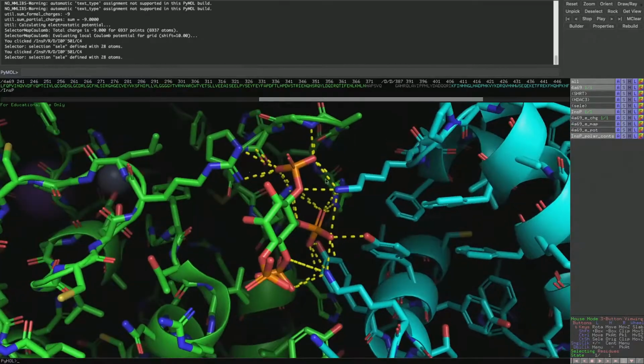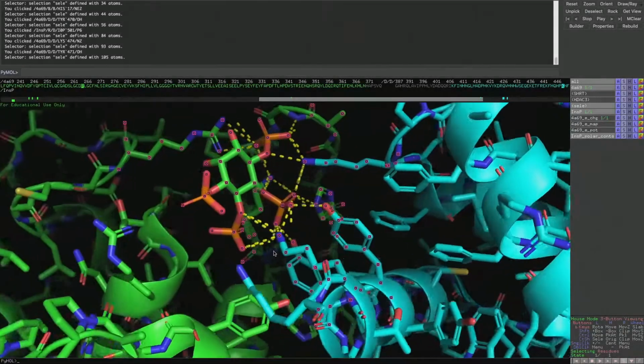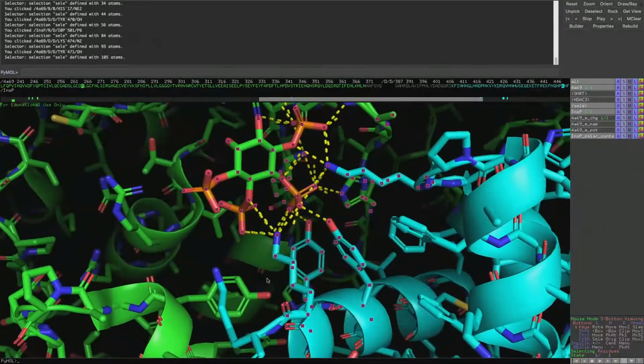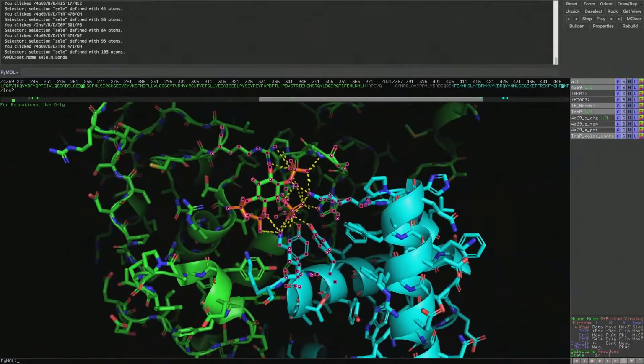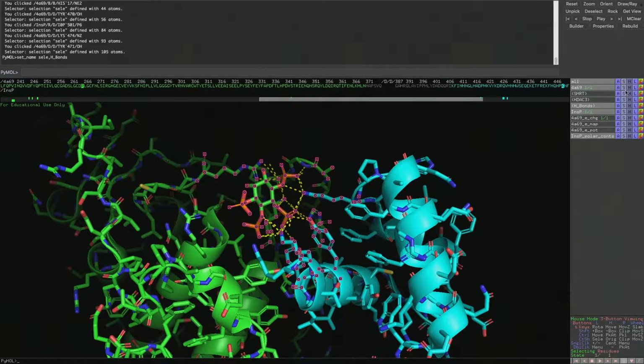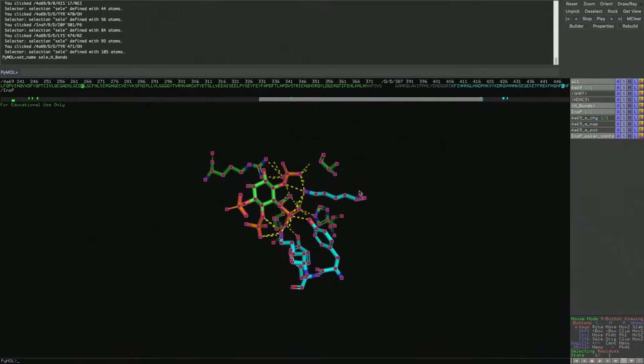So I'm going to select all of these residues, and I'm now going to make a new selection. So Action, Rename Selection. And these are the residues H bonds. And so I can now turn on and off that selection. So now in theory, what I can do is hide everything and just show these residues.